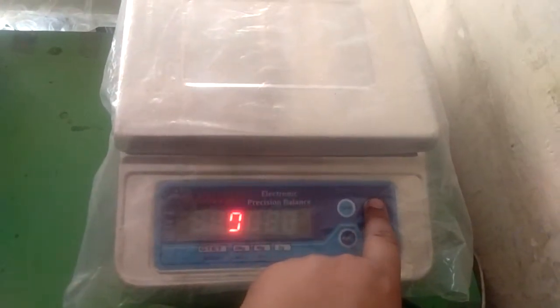Hello guys, welcome to my YouTube channel. In this video I'm going to show you how to calibrate an electronic weighing machine. I'm using a Goltec machine. Let's start — first press on.